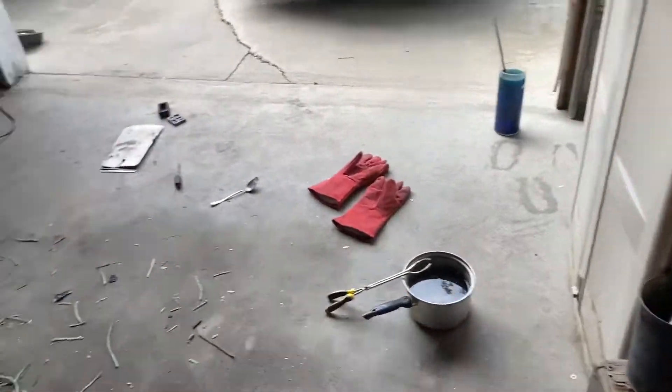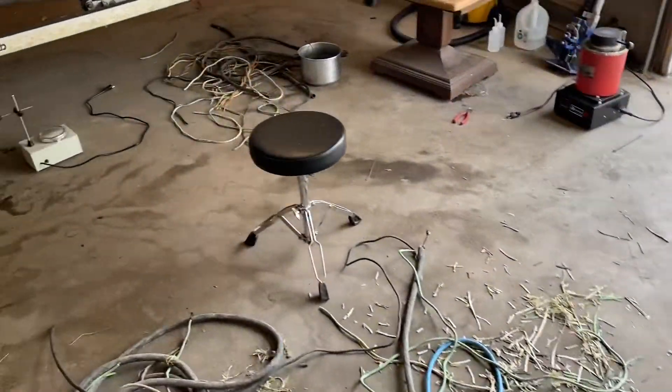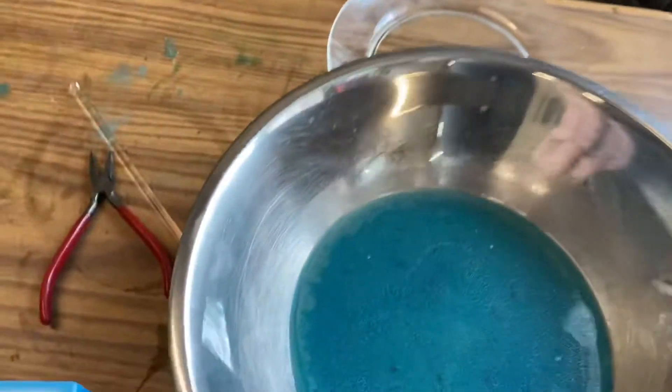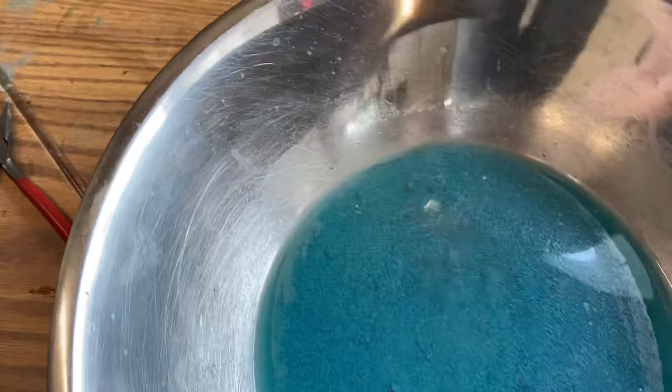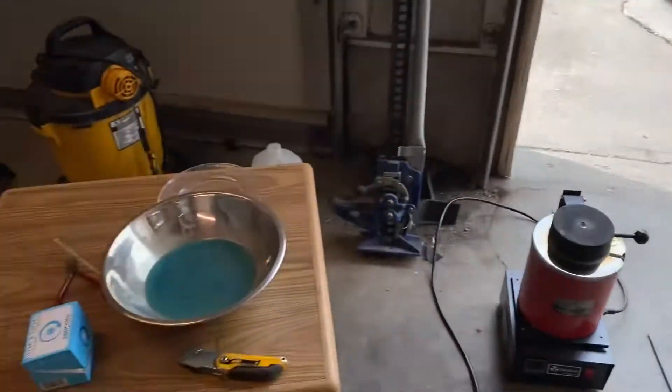I've been melting down some copper ingots today from all this wire and stuff, but I was also making some silver, which I have over here. I've run it through filters multiple times, and now it's ready to just burn off the rest of that, and it'll leave me with some silver precipitate that I can pour into some bars a little later.